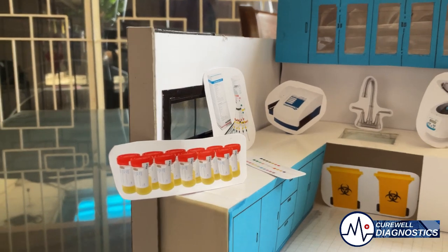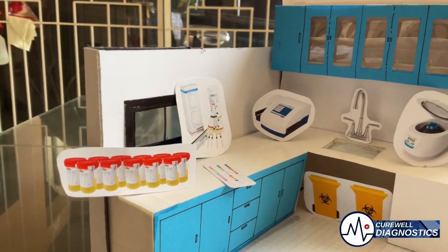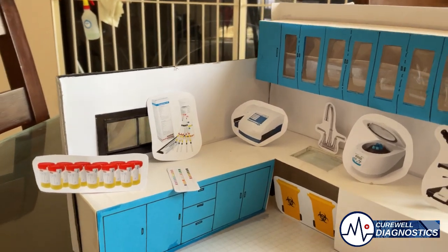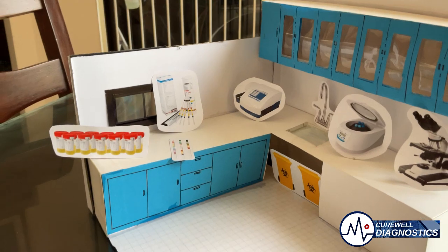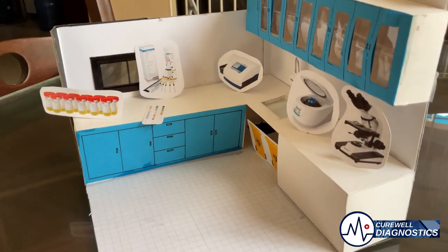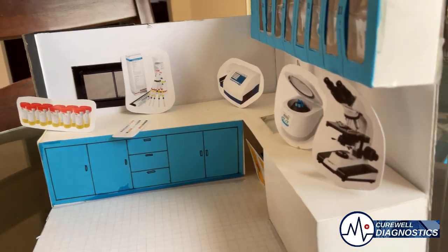We also have high-end microscopes, urine analyzers, and image analysis equipment that provide accuracy in our test results: compound microscopes, confocal, electron, and fluorescent microscopes. This concludes a short tour of our clinical microscopy section.